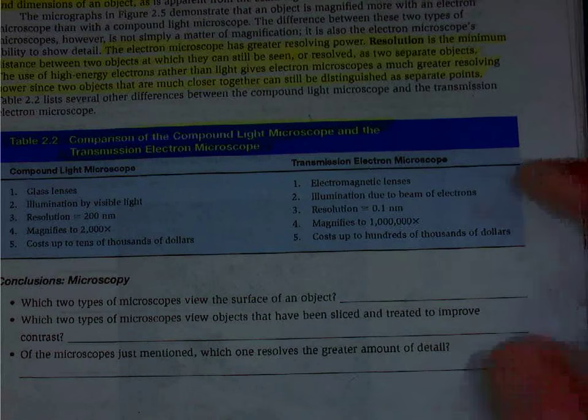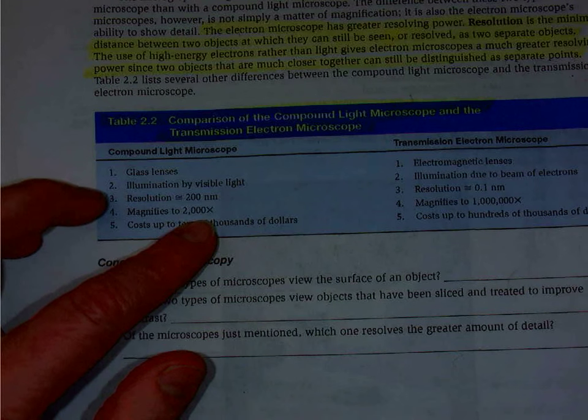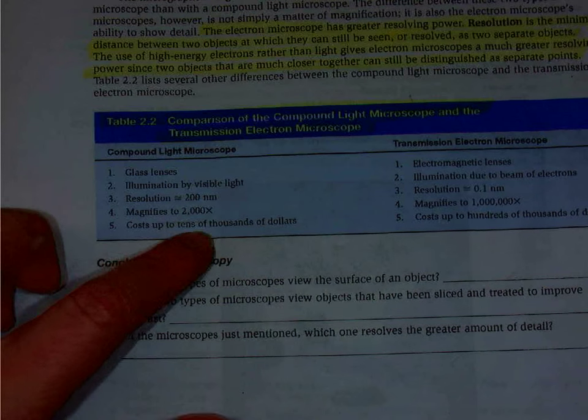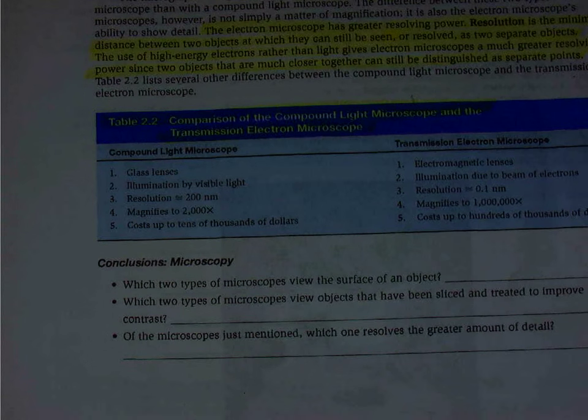Electron microscopes can measure up to 1,000,000 times, whereas the light microscopes, the ones we use in class, measure up to 1,000 times. They could measure as high as 2,000 times. We do not have that capability. Our microscopes only measure to 1,000 times.